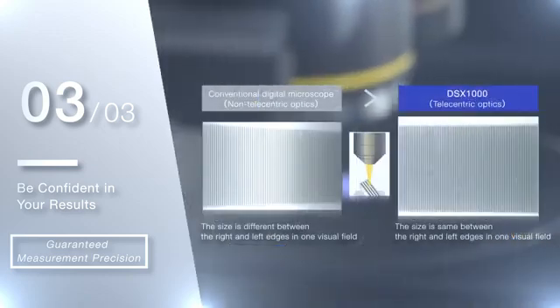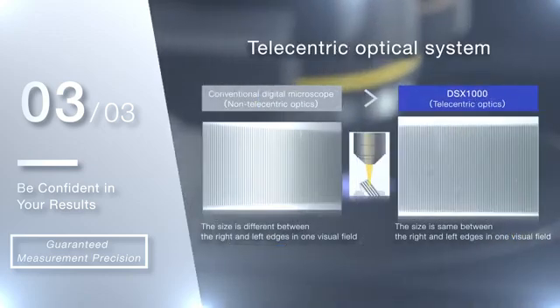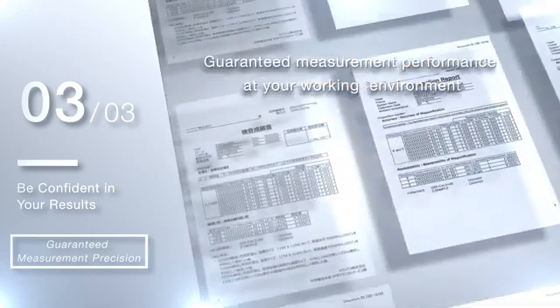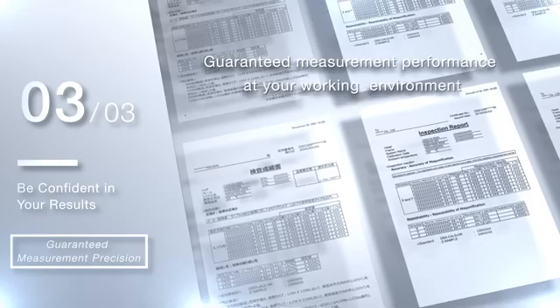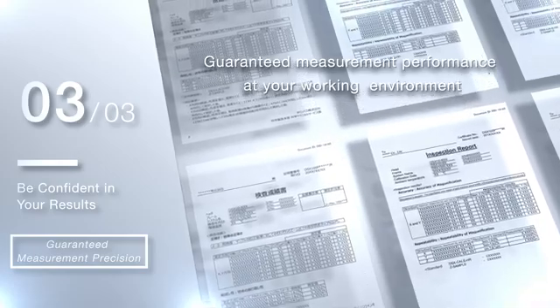The telecentric optical system corrects for the convergence effect that can make the size of an object look different depending on the focal point, greatly increasing measurement precision.